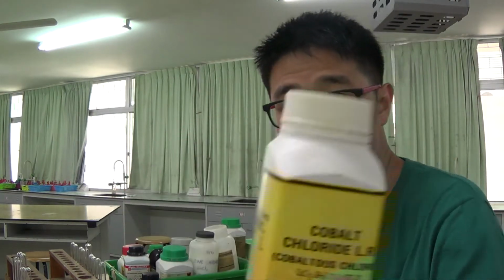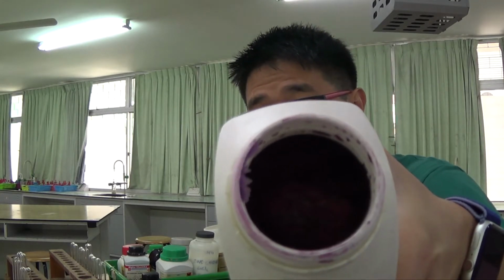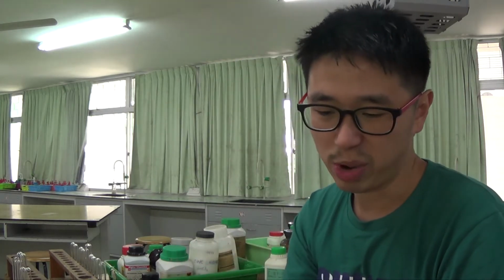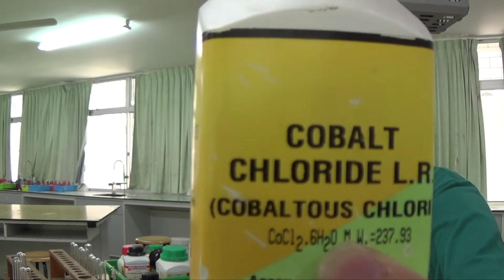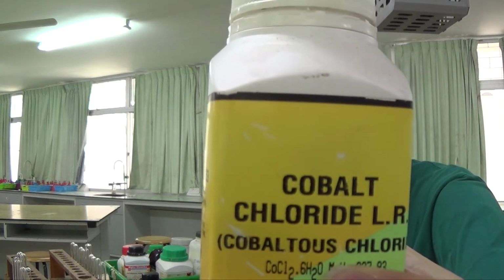One of which is this cobalt. This is cobalt chloride. It's actually part of the A2, which is the second year of A-level chemistry syllabus. This is a pink color solid, and when it's hydrated, it is pink. And when you have this solution and you coat it onto the filter paper, this is the test for... oops, sorry. When you remove the water of crystallization, then it becomes blue.